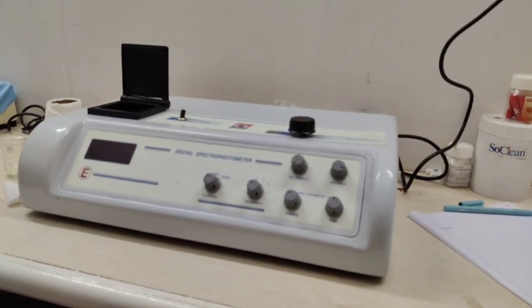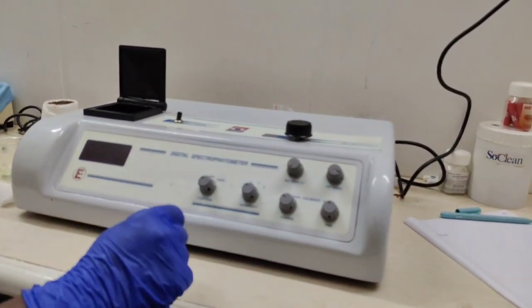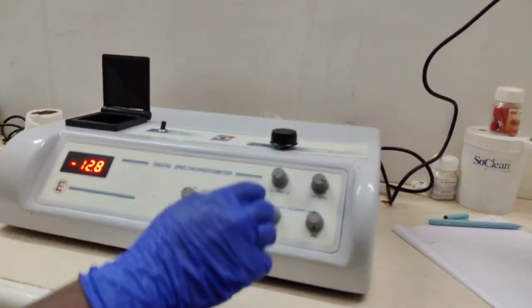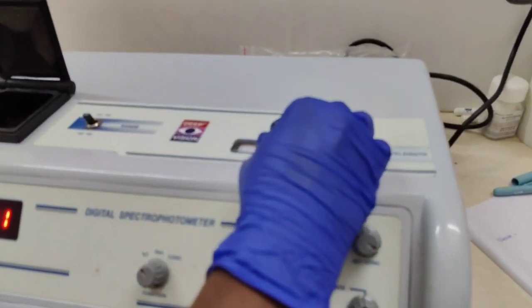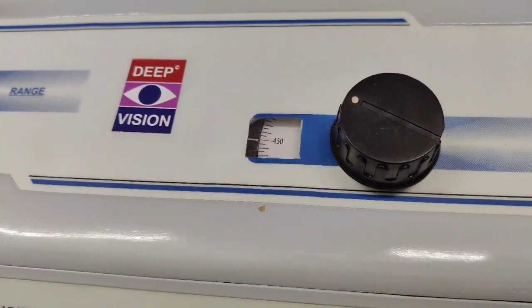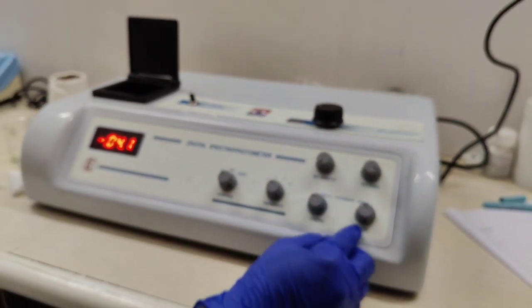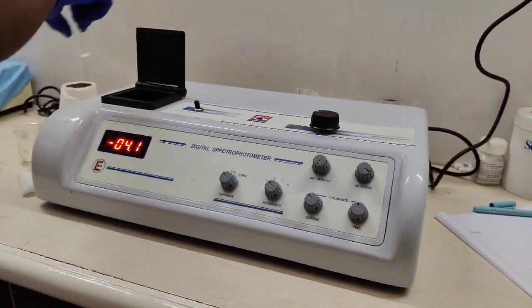Let's go to the experiment. This is a digital spectrophotometer. Set the spectrophotometer to the desired wavelength, 450 nanometers. Set the calibration, coarse and fine. Then set 0 on concentration.